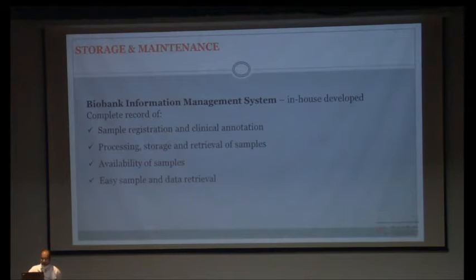Now, storage and maintenance. For the maintenance of the clinical data for particular samples, we have designed and developed an in-house biobank information management software called BIMS, where we can maintain the patient sample registration, their clinical annotation, and the processing details. Each and every processing detail is mentioned in a stepwise manner in the biobank software, where they are stored, along with retrieval and live tracking of the samples. Whenever you take out a sample, it will be depicted as a vacant vial in the software map.